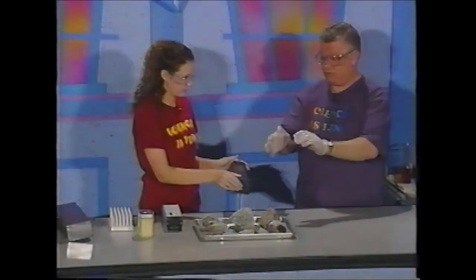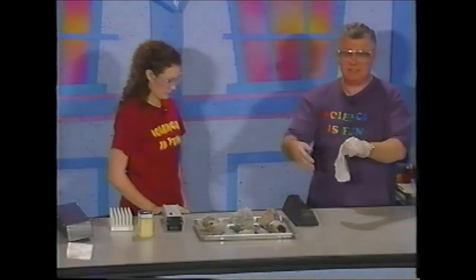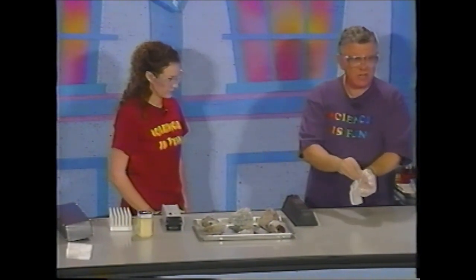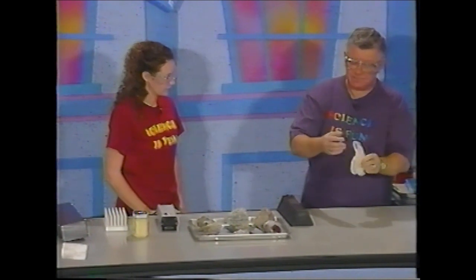Now with the lights back up, you can see there is no fluorescence whatsoever here. Only when you use black light, you can see this effect. So it's not only in rocks, but in other chemicals. And fluorescence is a very common method for analyzing a variety of substances.